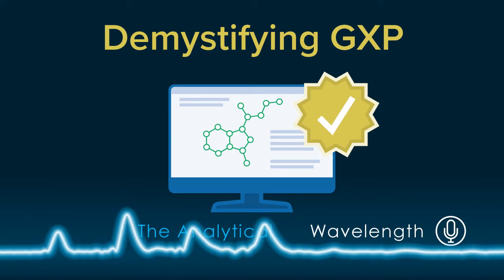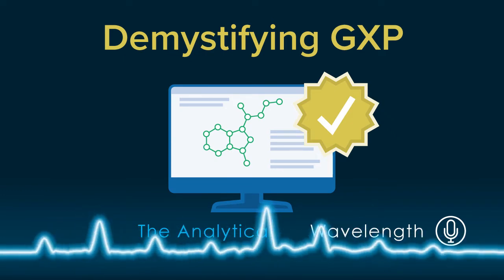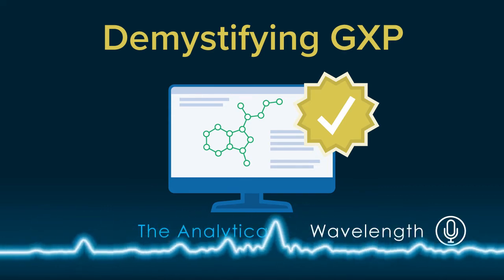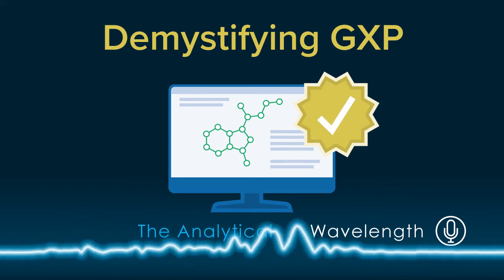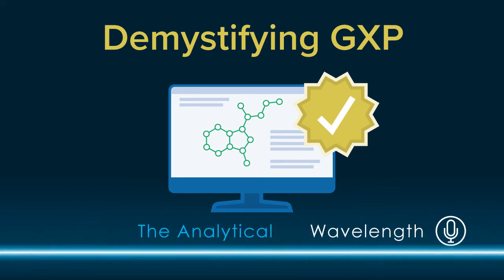However, along with the software functionality, a company must include standard operating procedures to ensure that all of the regulations are being followed. For example, the idea of having user accounts. The software has the capability of allowing people to create their own user accounts with passwords.